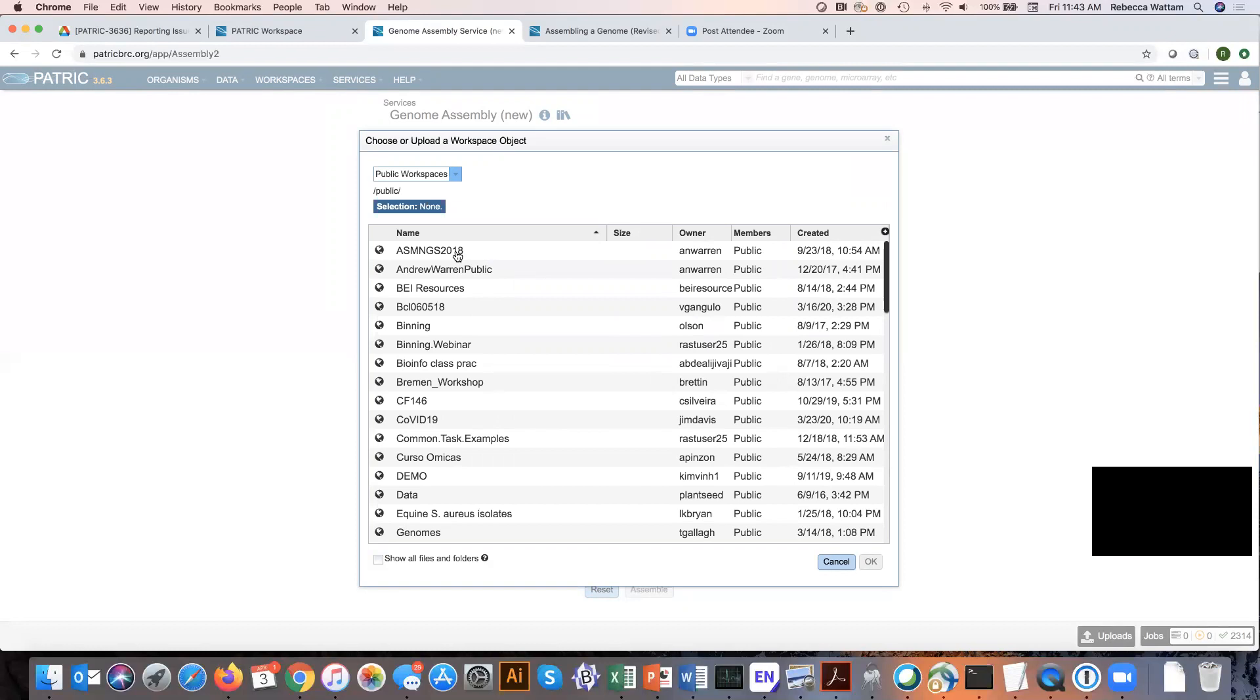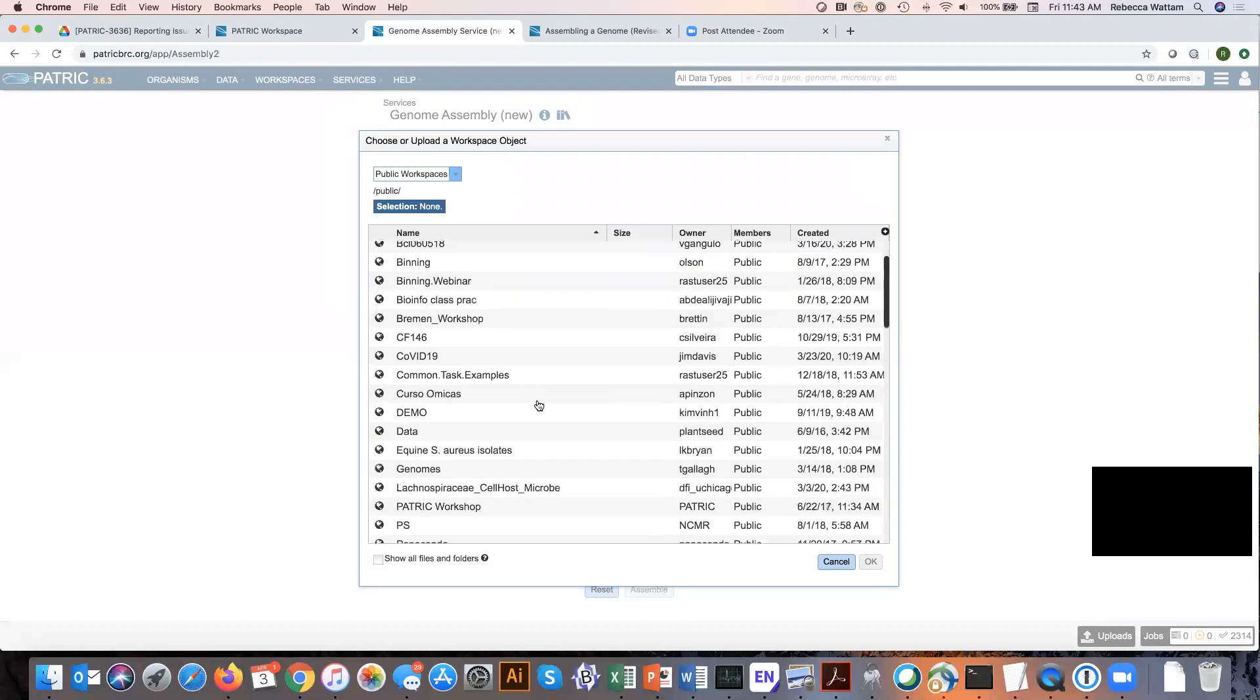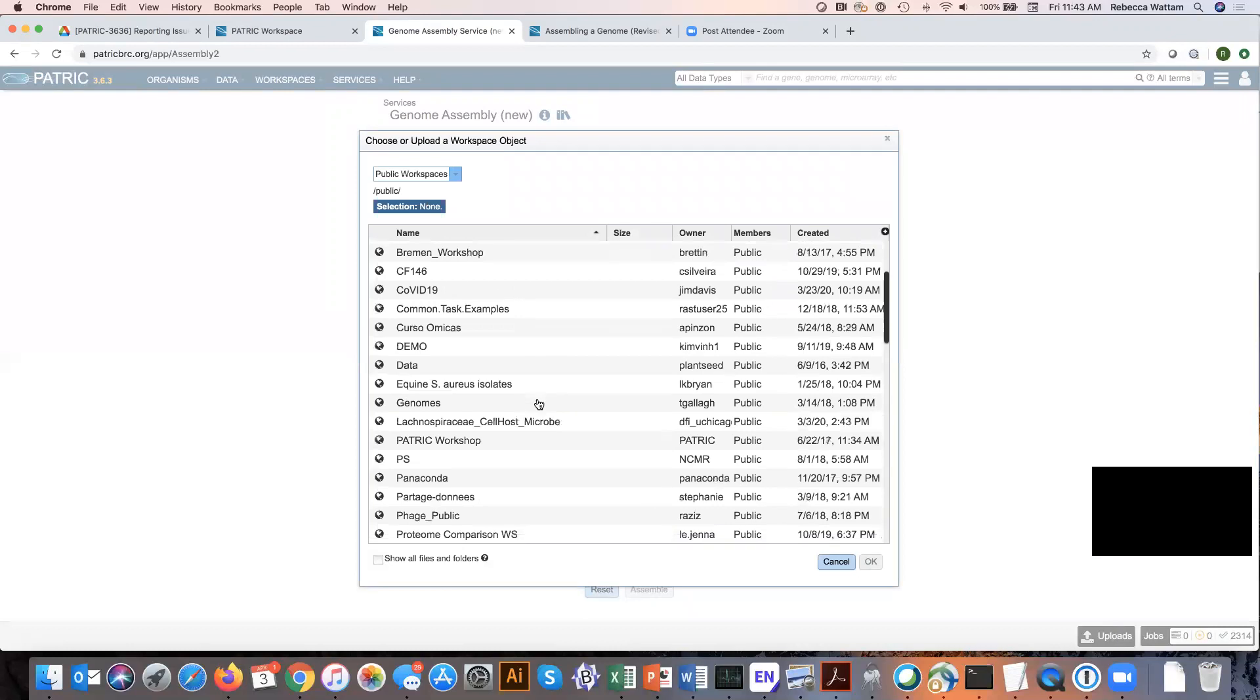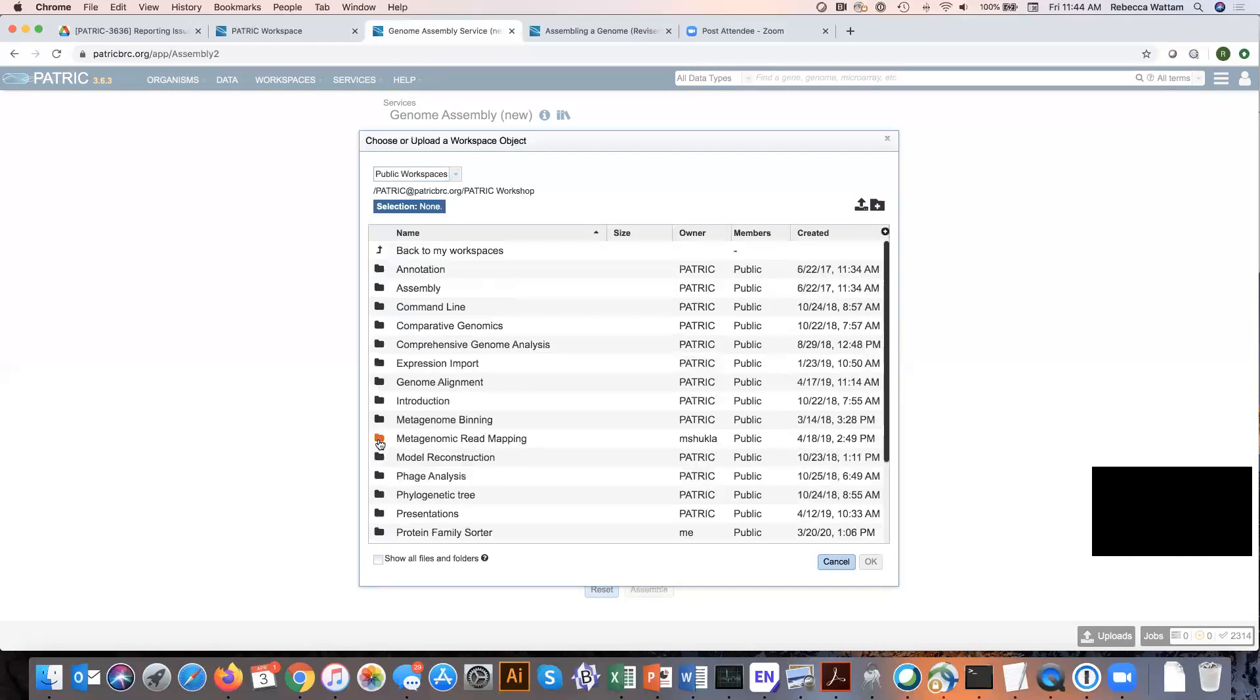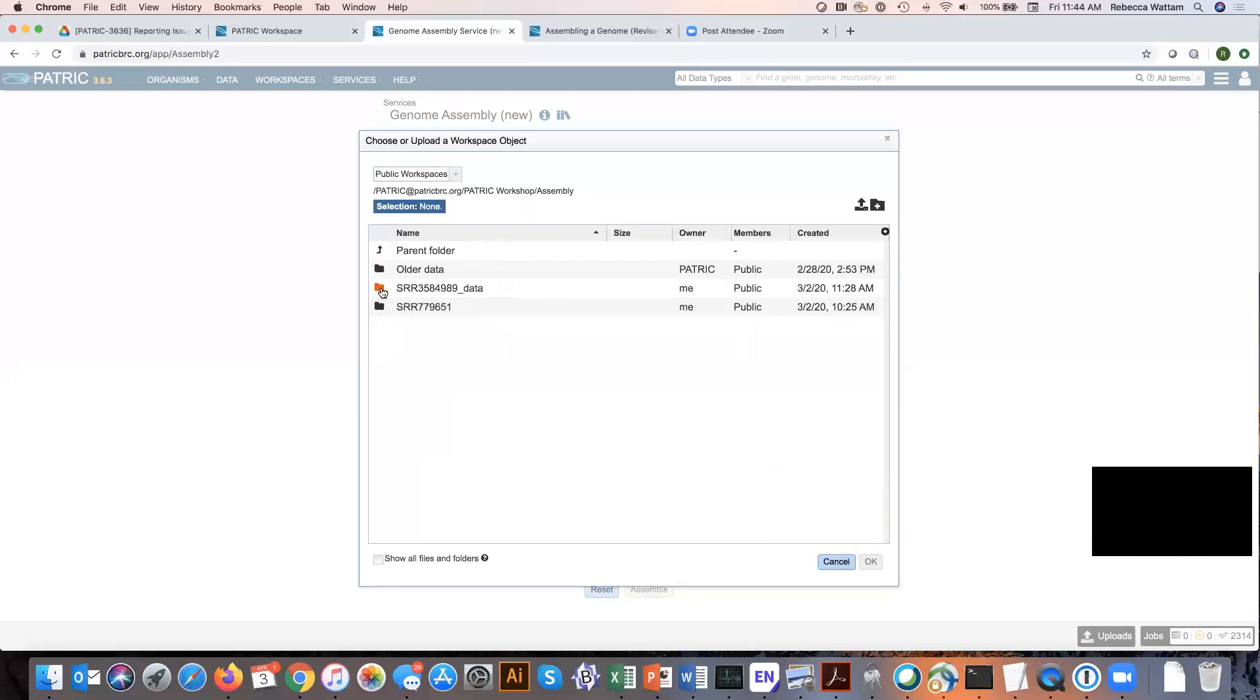This will reload this data to show all the public workspaces that you have access to. We each should have this workspace which is called Patrick Workshop. Click on this little globe icon here and that shows all the folders within Patrick workspaces. Click on the folder icon for assembly.